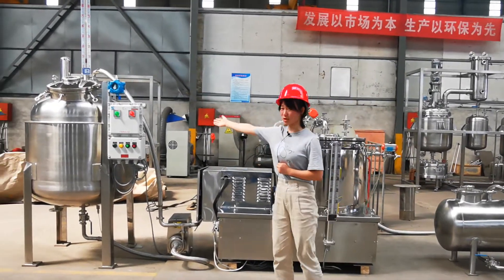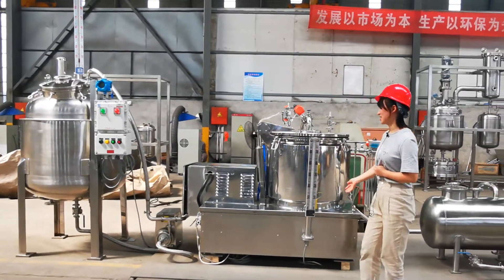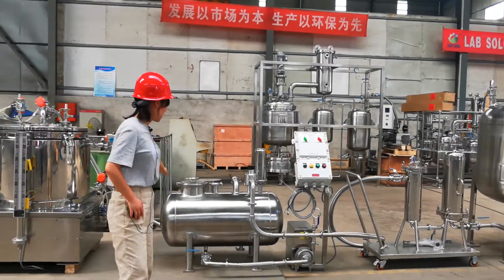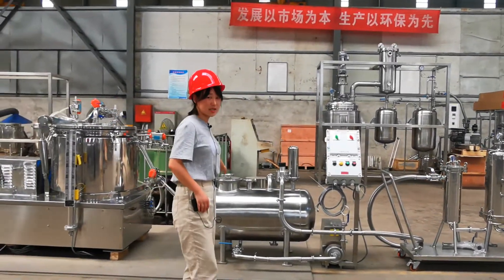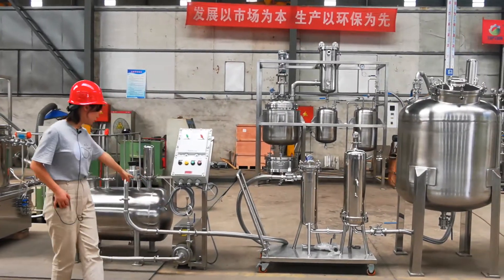This is our storage tank for the centrifuge extractor. This is our centrifuge extractor. And this is our storage tank. And this is our centrifuge pump.